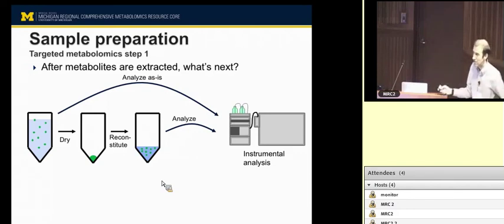Sorry, I had a question. Sure. Go back. When you're talking about authentic standards, are you meaning standards that can be created in the lab, or are you talking actual proper standards? So that term authentic standard is a little bit of a term I don't even always like, but it's frequently used to differentiate. It's something that you might purchase from Sigma Aldrich.